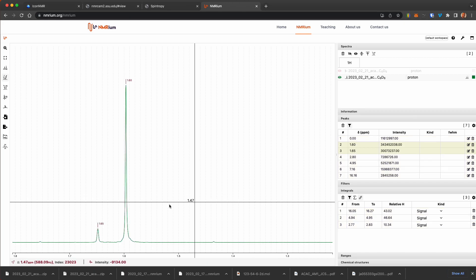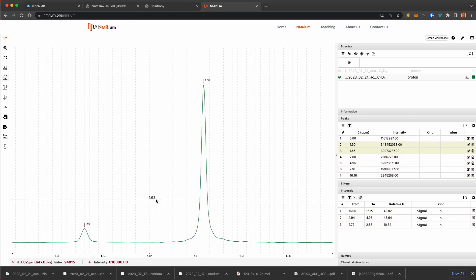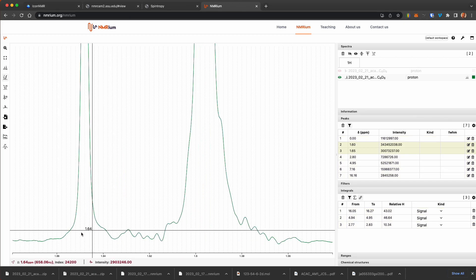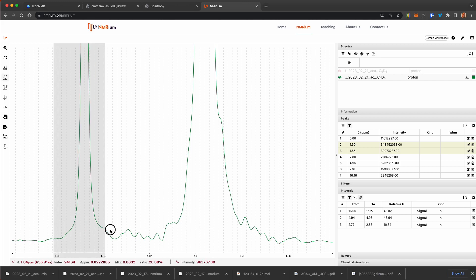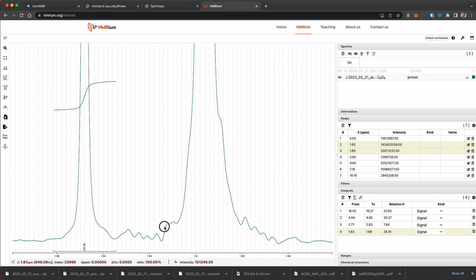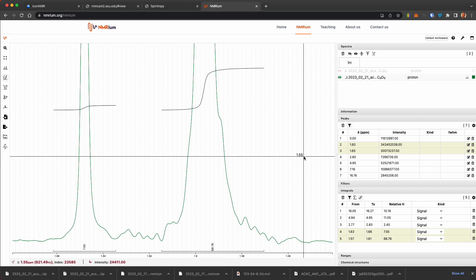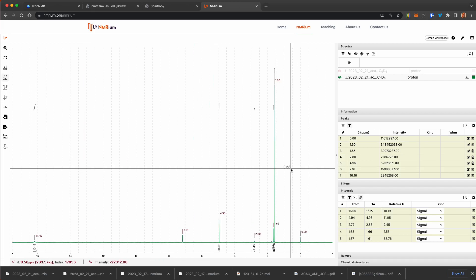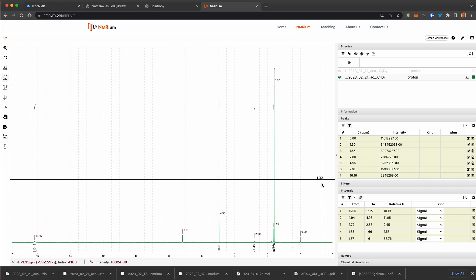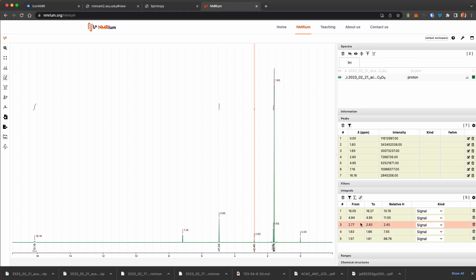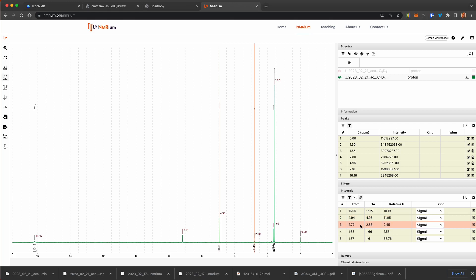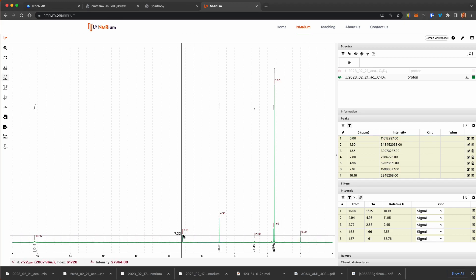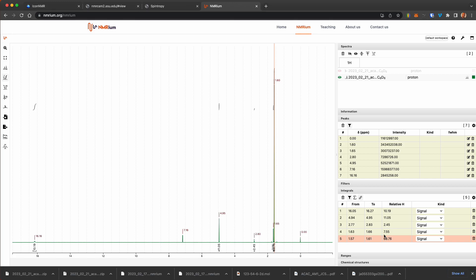Now, here we have the methyls. And so we'll blow this up and highlight that one and then this one. Okay. So now we have integrals for the methyls, the methine, or the methylene, the methine, and the acid. And you can see it highlights through each of these peaks. We don't need an integral for the TMS or the solvent.